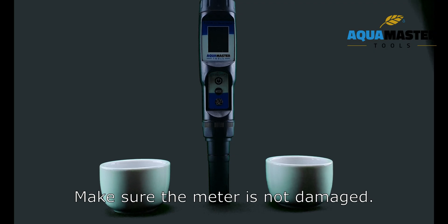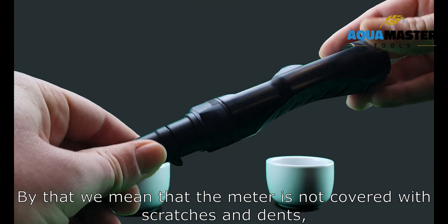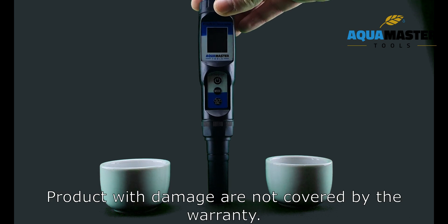Make sure the meter is not damaged. By that we mean that the meter is not covered with scratches and dents, or full of soil and other pollution. Products with damage are not covered by the warranty.